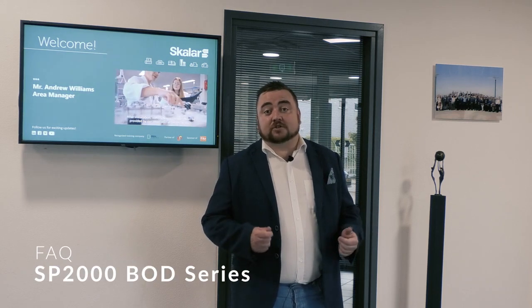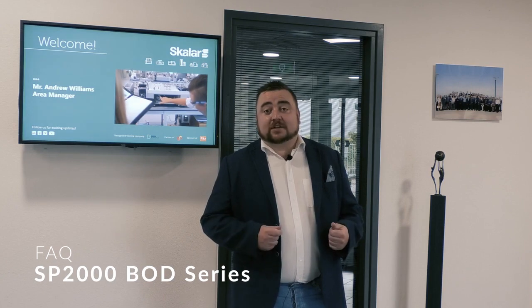Today is part 2 of an ongoing series of videos where I'm gathering up the 5 most frequently asked questions across all our different product groups. And today I will be talking about the BOD application, Biochemical Oxygen Demand. This application is on our SP2000 series of robotic analyzers.